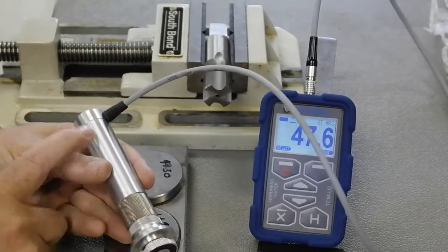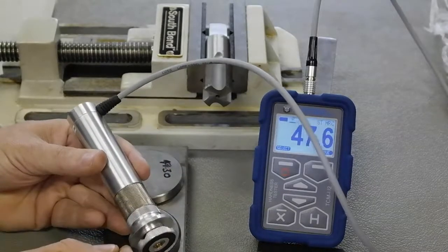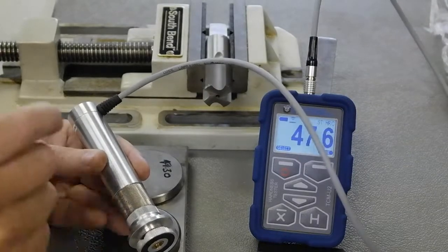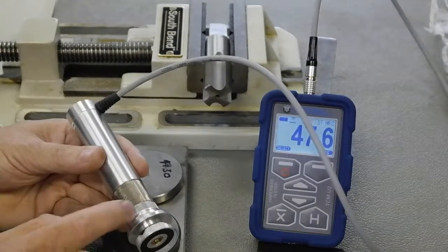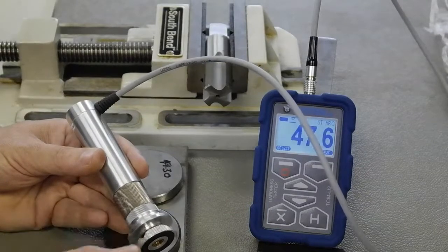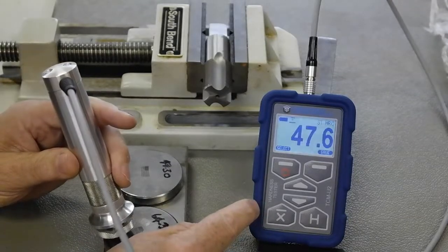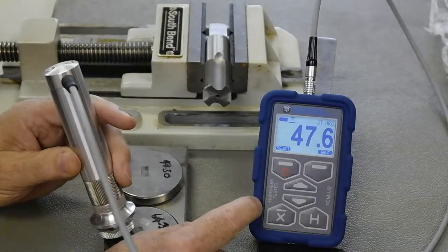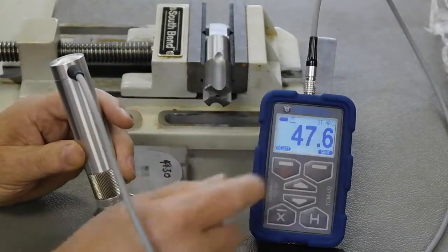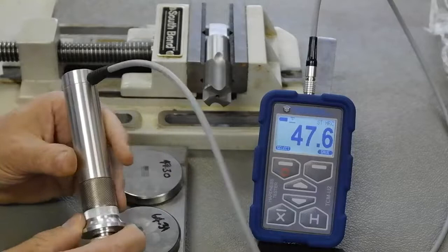With the probe it has its own memory inside where the calibrations are stored. So the probes are interchangeable with different testers. This is a 50N probe which means it requires 12.5 pounds of force pressing down to give an accurate reading. We include the foot of the device which we call the puck or the foot. Other companies do charge for it. We include the rechargeable battery charger, heavy duty case for the device, communication software, and a cable USB you can see on top here to communicate to a PC to print the data. And of course it has its own memory where you can store multiple tests.